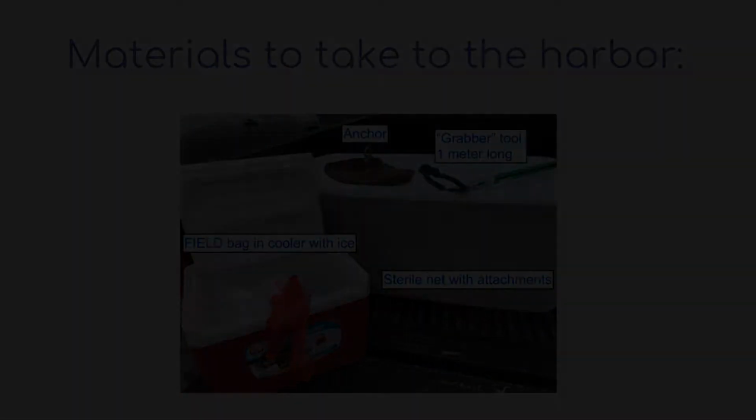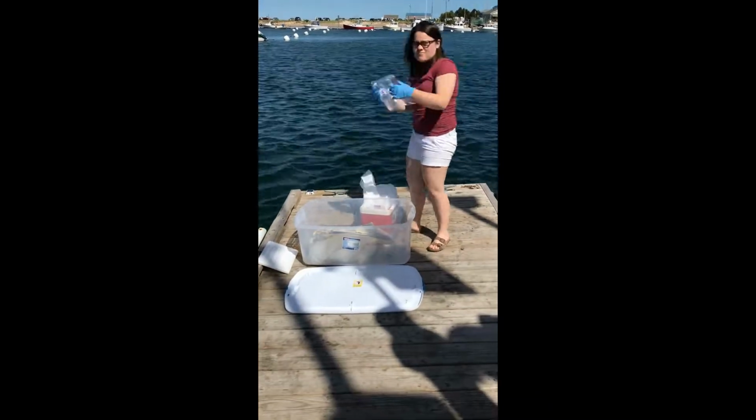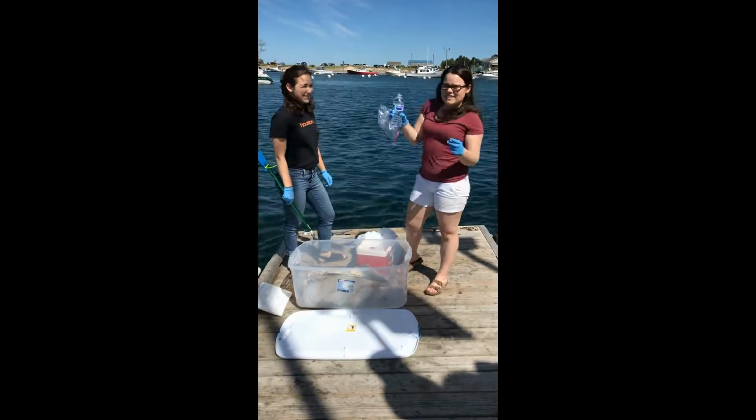All right, we're ready to take our harbor samples. So I'm going to be the sampler today, and Michelle is going to be the assistant. That's a great way to prevent contamination in the field. I'm going to pour out the water in that water bottle.